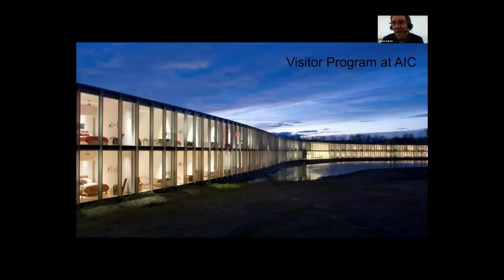So what I work on at Janelia is in a center called the Advanced Imaging Center. It was started about 2014, and it was started with the goal for sharing some of the imaging technologies that were developed at Janelia to the wider world.